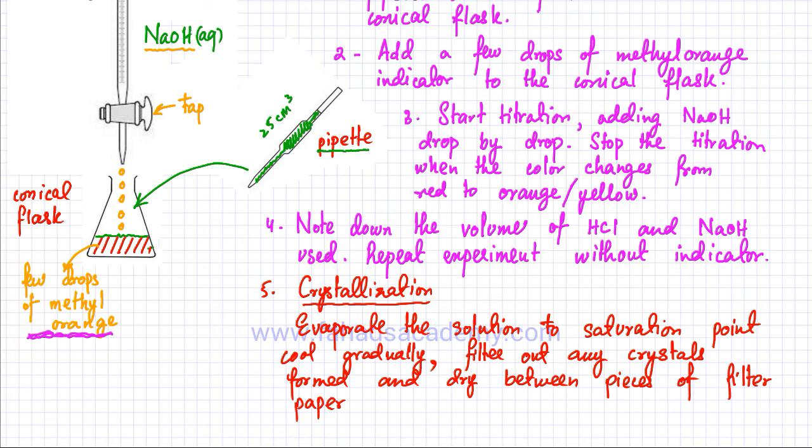Now, these are 5 steps that I've written down. Depending on the question and the size of the answer required, if it's a 4 or 5 mark question, it would be better that you write all these points. Remember, crystallization is a very important point, because most of the time they ask for pure dry crystals. So you have to describe crystallization in detail. You can shorten the other points.